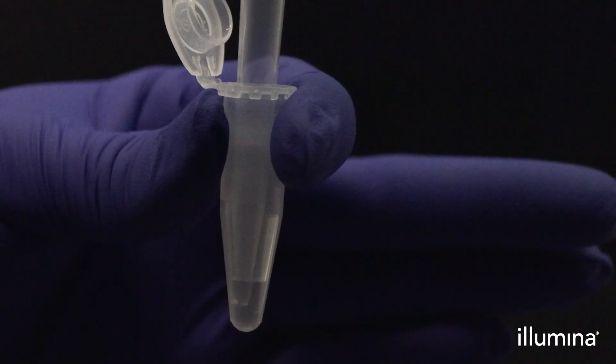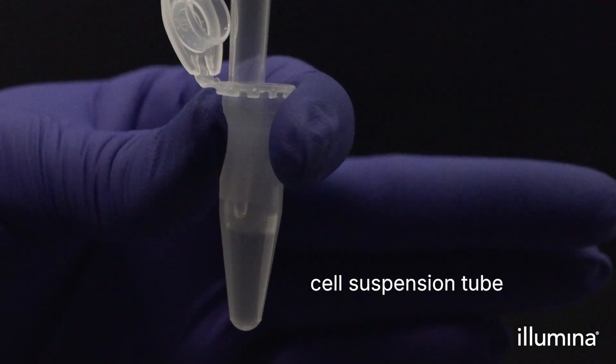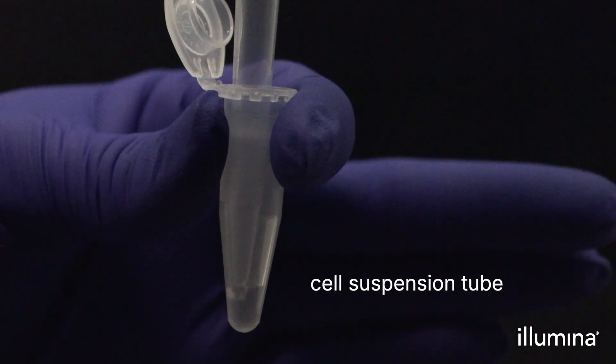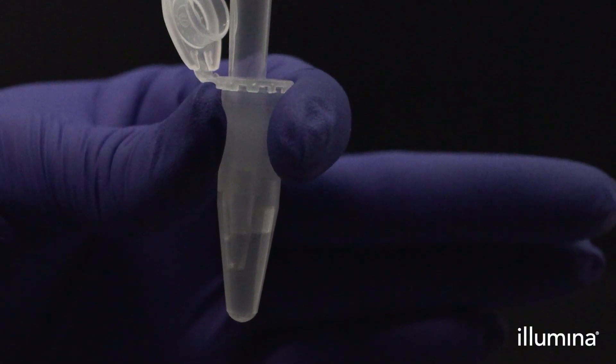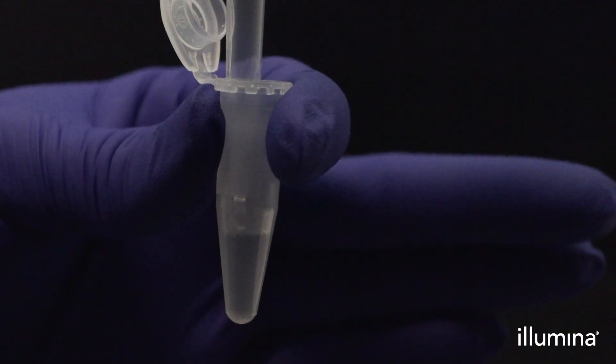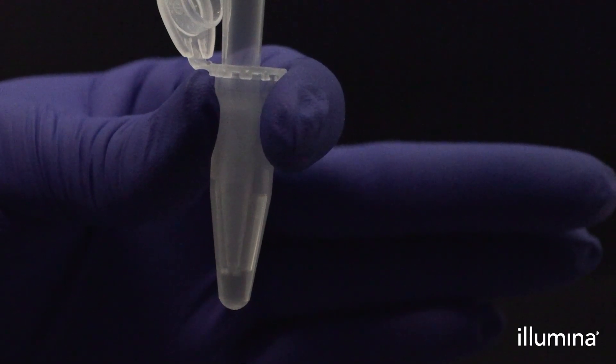First, gently pipette mix your cell or nuclei suspension ten times with a wide-bore P200 pipette tip. The cell or nuclei suspension should be freshly mixed before transferring into the pips to prevent settling from impacting your sample loading.